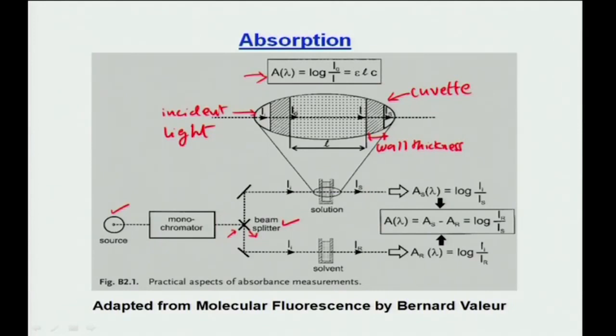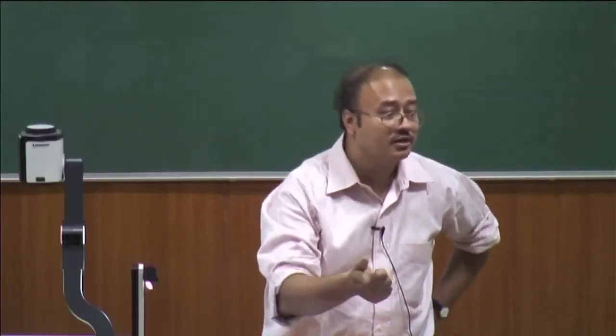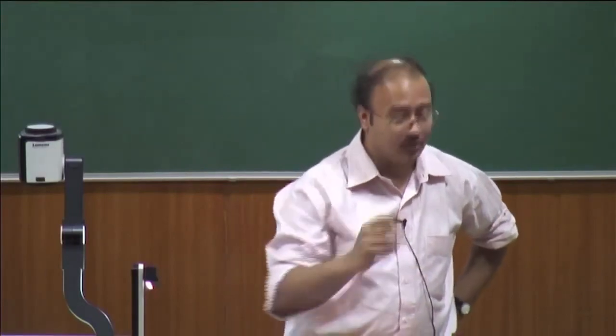Suppose in this one, IS, where S stands for your sample. And here, when you are talking about this one, it is IR, where R is your reference. Now, what do you mean by that? That means, suppose you have taken a compound in a certain solvent, which is a sample. The reference is typically the one which does not have the compound. That means it is only the solvent for you, right.